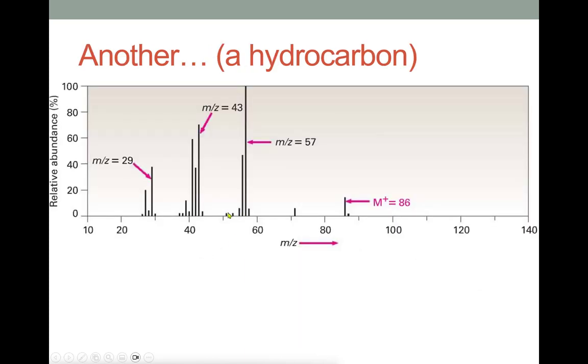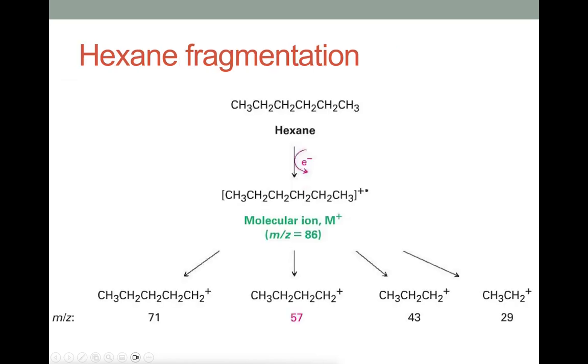Now again, I have all these little tiny other peaks here that could be due to who knows what, lots of little molecular analyses. Remember, we're blasting this thing with a really highly powerful ionization source. So all sorts of unlikely rearrangements and things could happen. But my pattern indicates that, in fact, I do match straight chain hexane. So that'd be my analysis for this one.